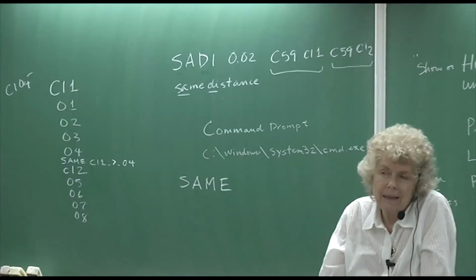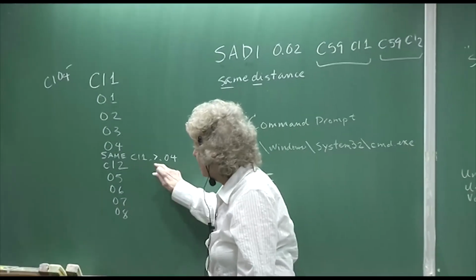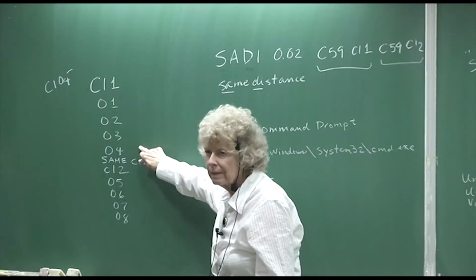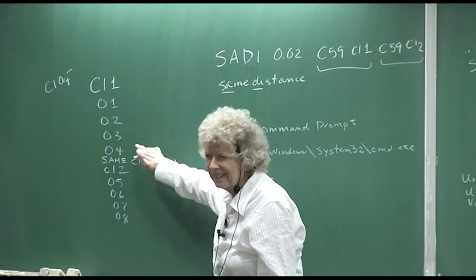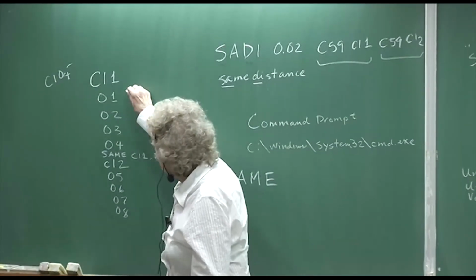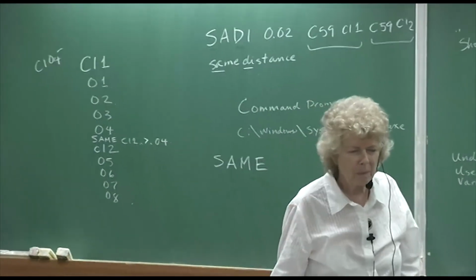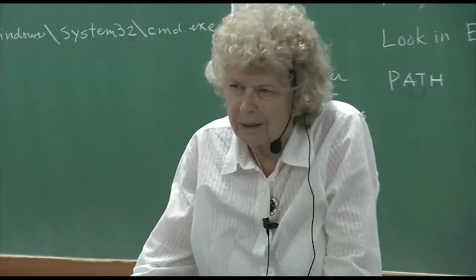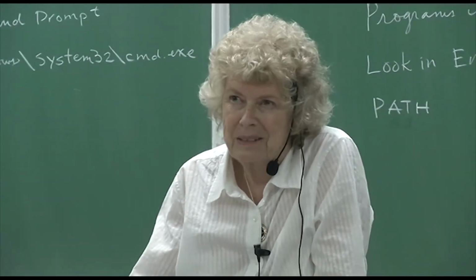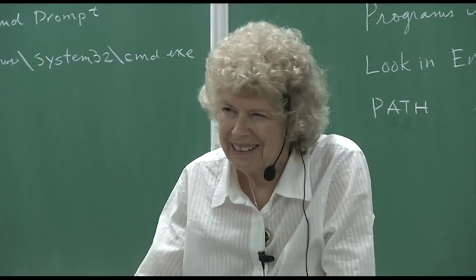It could be that you won't need it again because this has now been figured out and it's well behaved. But initially, it will optimize that geometry to match this one. Is that clear? Okay, good. Again, the order is very important. If these are not in the same order, then it won't work. So, perchlorate is not bad because the order doesn't matter so much, but in some other molecules it will matter. And then you'll just mess it up completely if they're not in the right order. Okay? Yeah, go ahead.